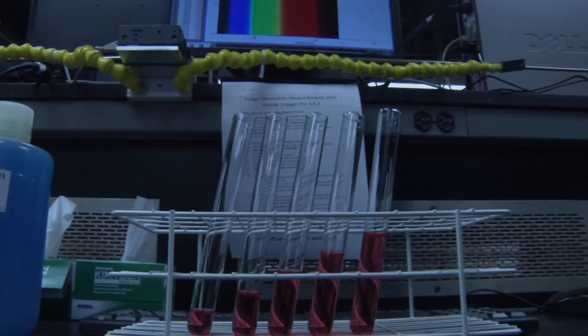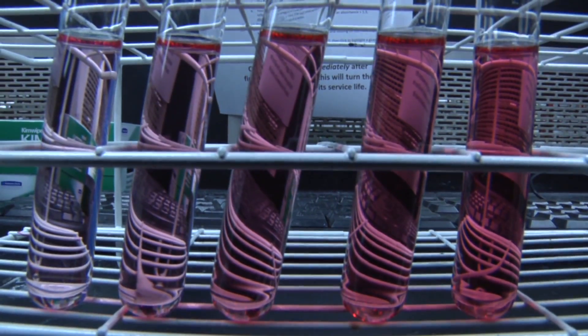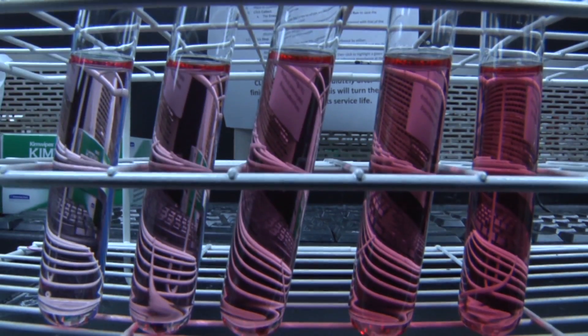After rinsing the pipette with distilled water, use it to add known amounts of distilled water to each test tube. The calculations will be easiest if you make all the total volumes the same.